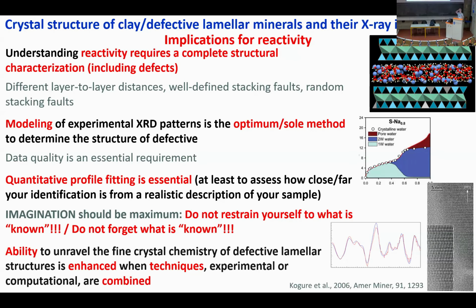Thank you. Do you have any advice if you're looking to do X-ray diffraction on complex mineral mixtures where you're actually caring about what kind of cations may be interchanged on the structure? So you have a complex mixture and you're looking to see, from a geochemical perspective, did this react? Did this not react?